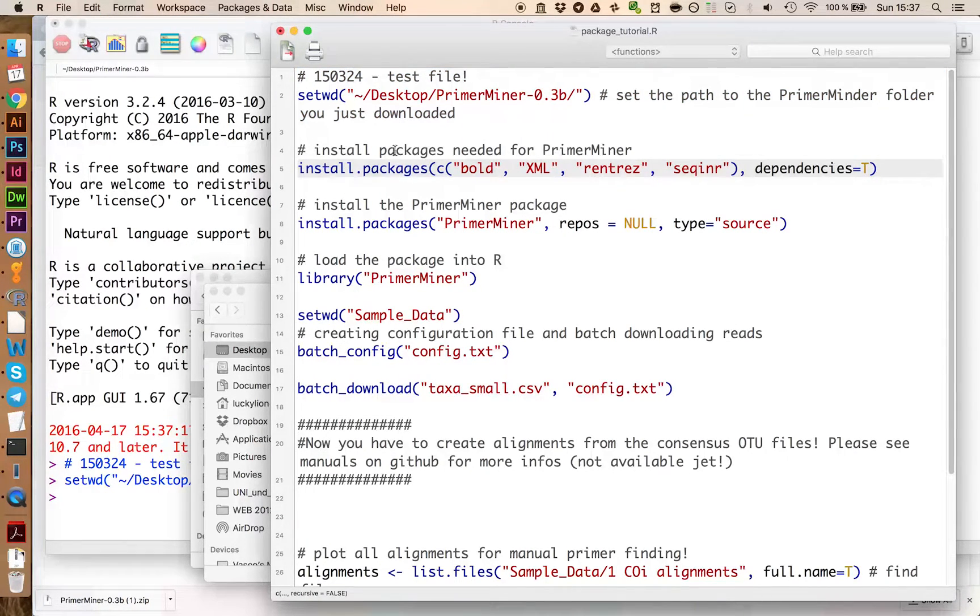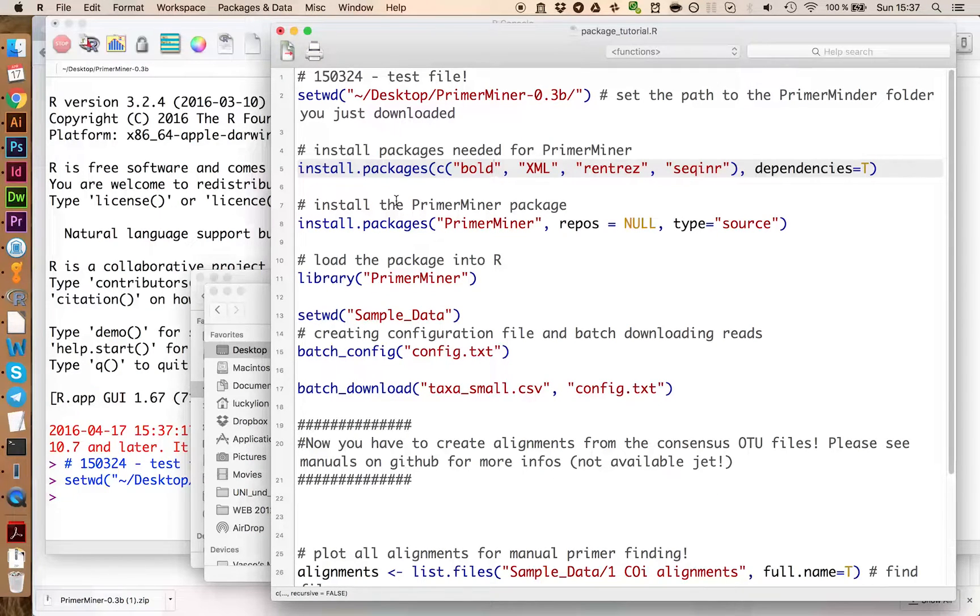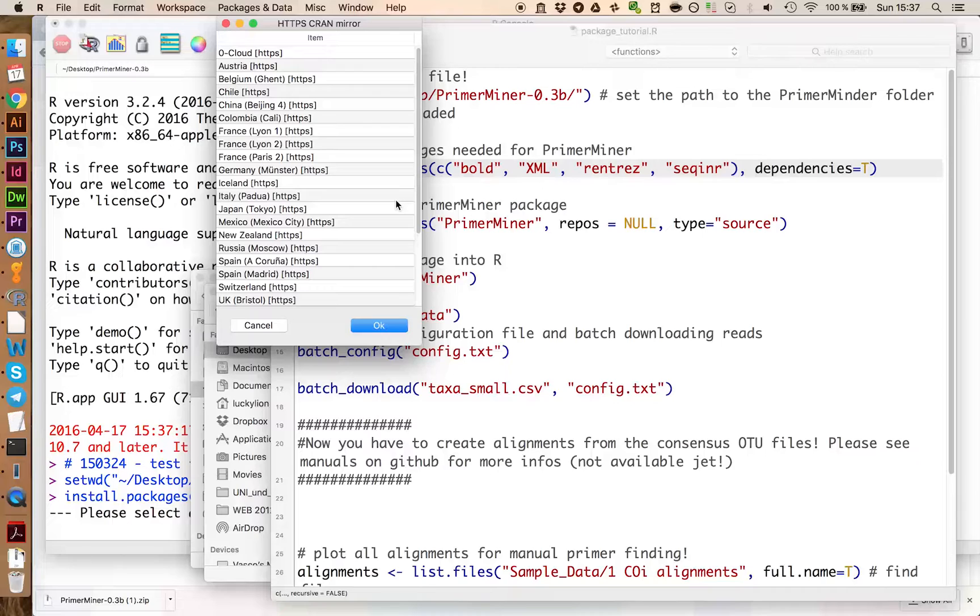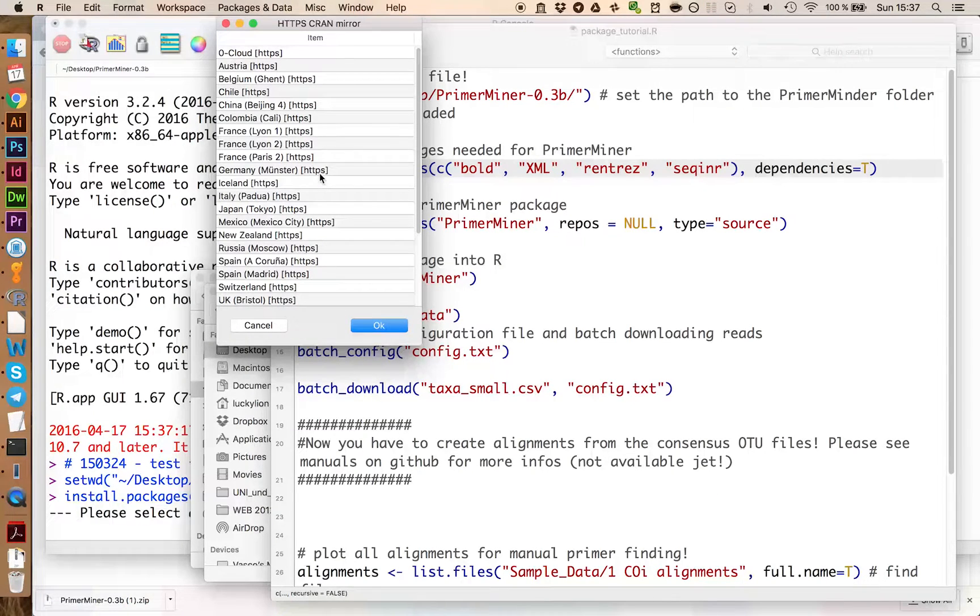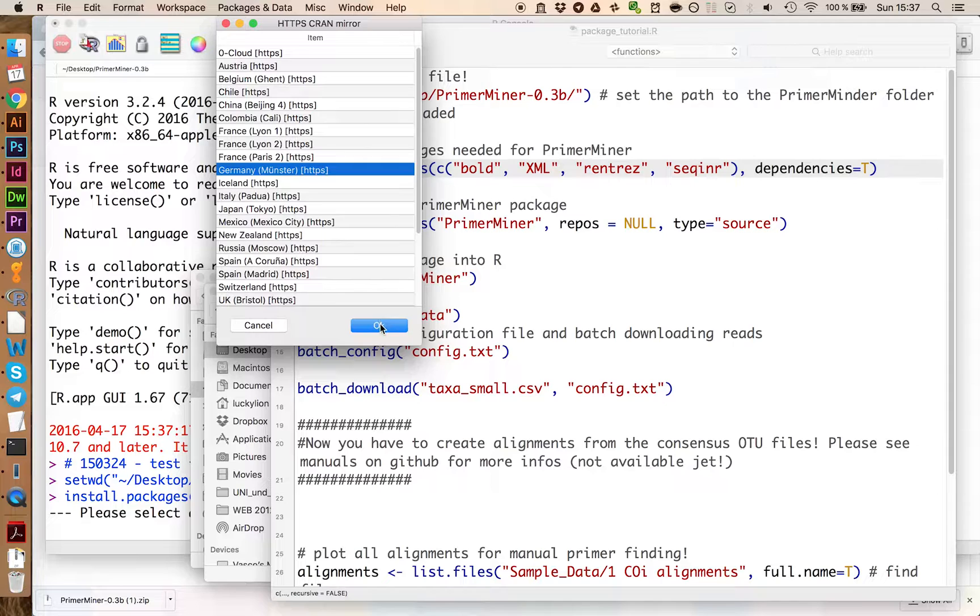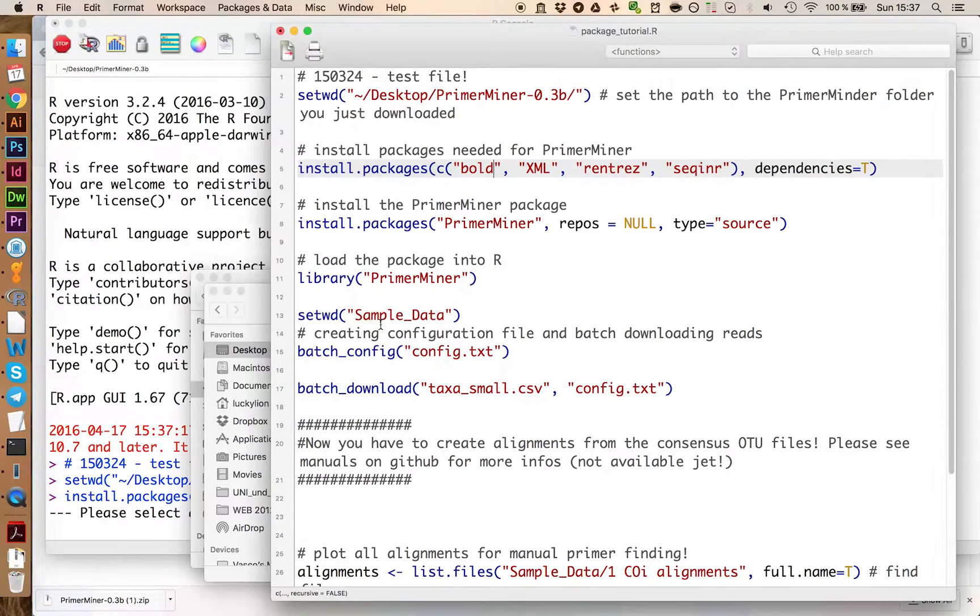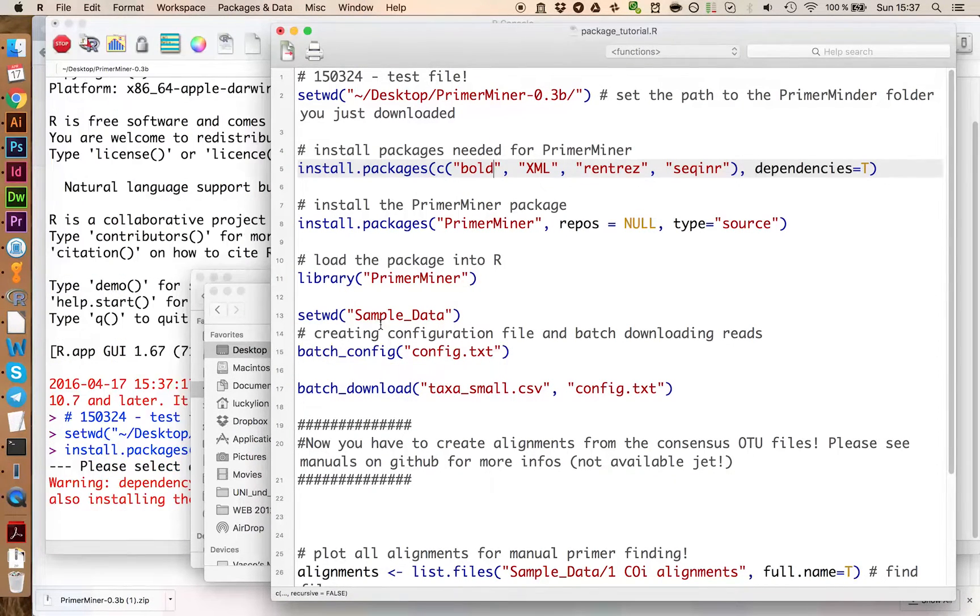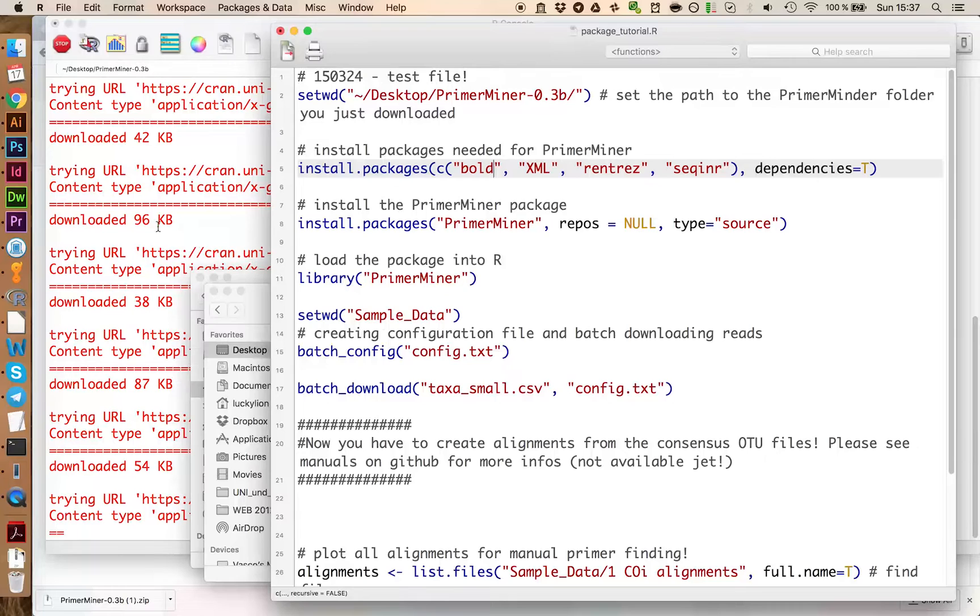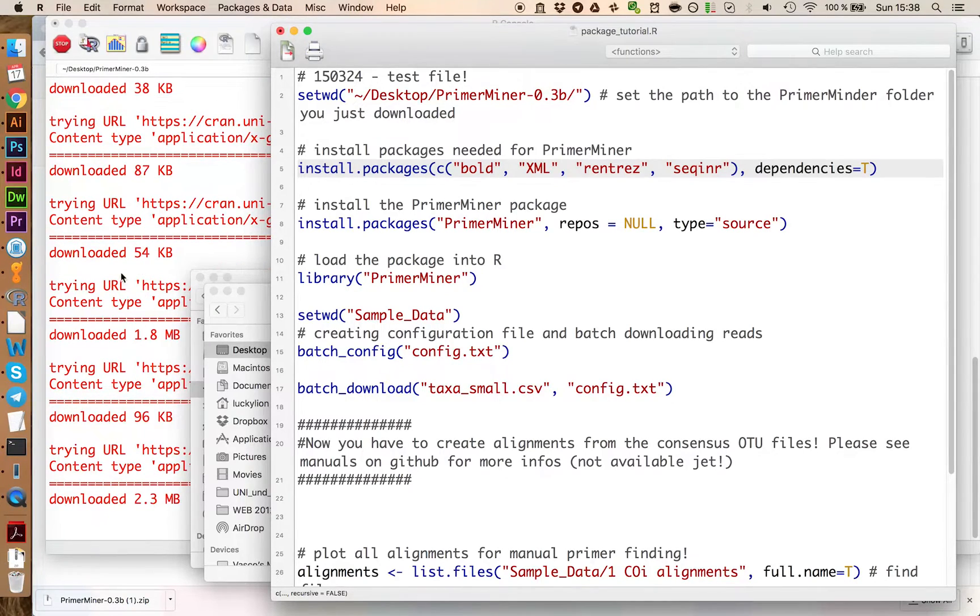Now we have to install these packages here that PrimerMiner needs to work. It asks you to select a mirror. In this case I select Germany because we are based in Germany and it will download the packages.